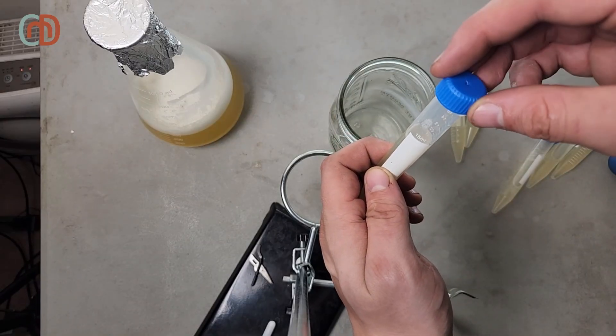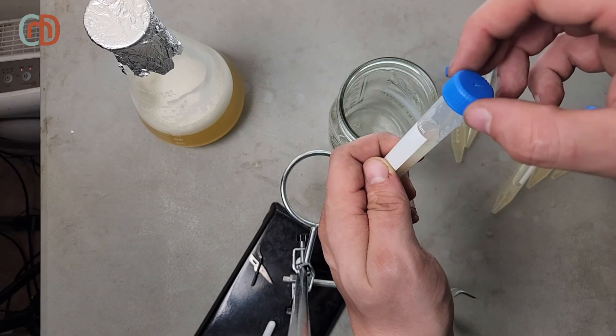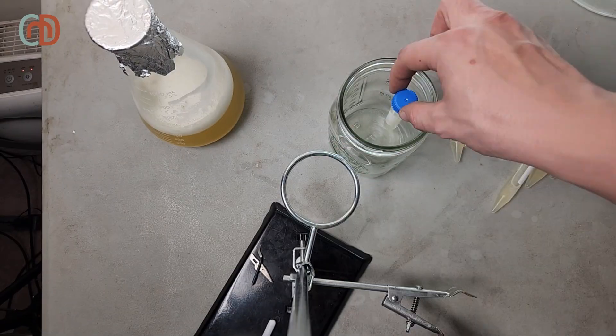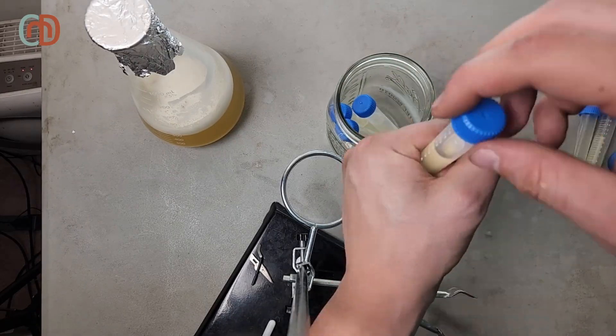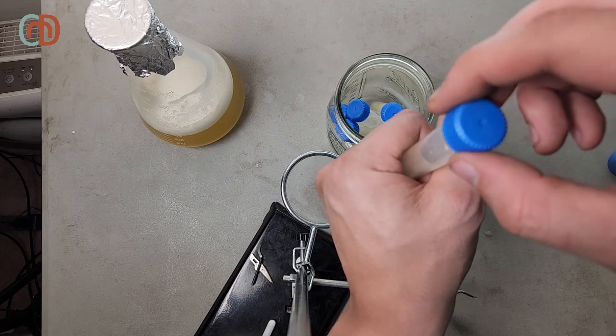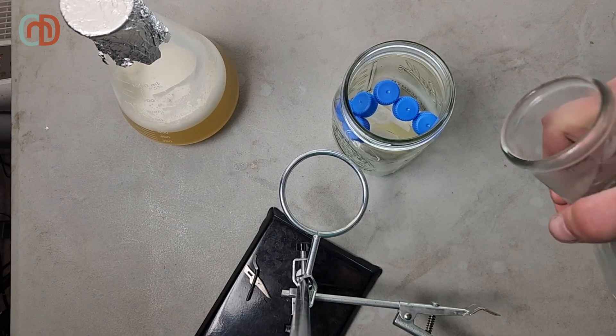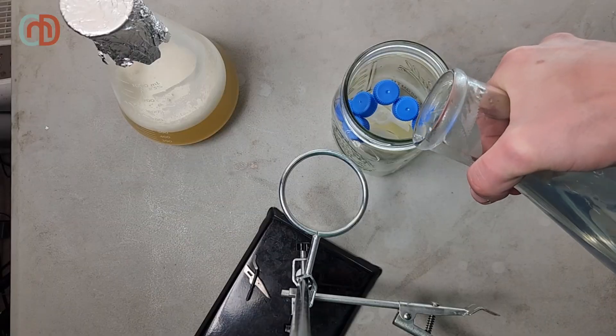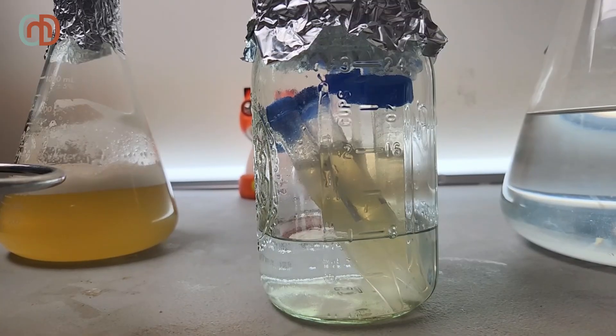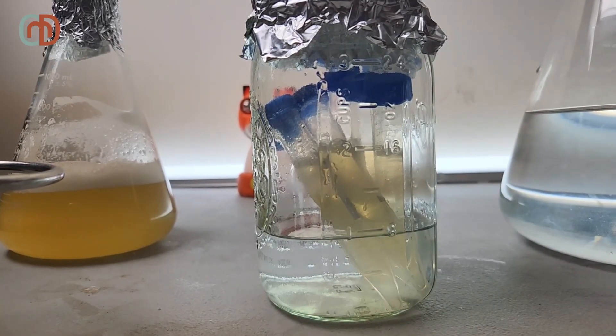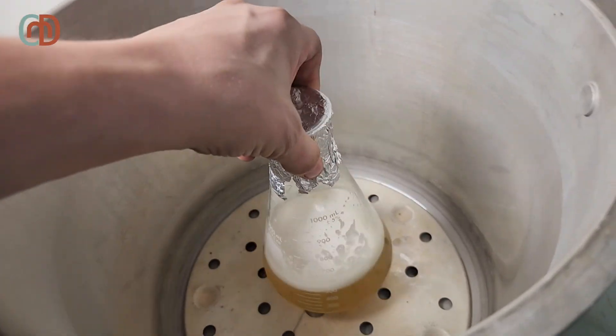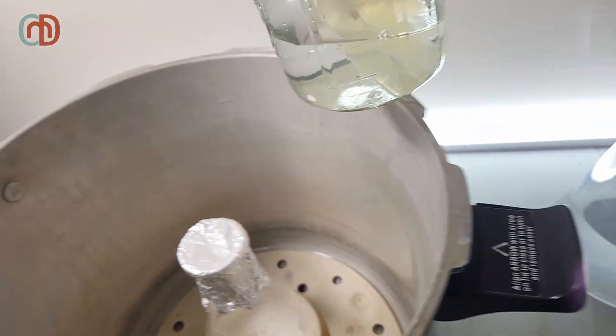Once the vials are filled, I loosen the lids and pressure cook everything to ensure that they're sterile. That's because at this stage, sterility is still very important, as we're trying to isolate single cell colonies. If you don't want to deal with all this sterile procedure, you can buy a yeast packet from a commercial vendor. And that is an effective way to ferment your own alcohol, but I find it a lot more fun to culture and store your own yeast. Just like before, I pressure cook at 15 PSI for 10 to 15 minutes.